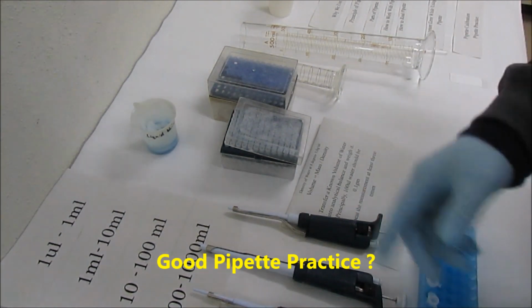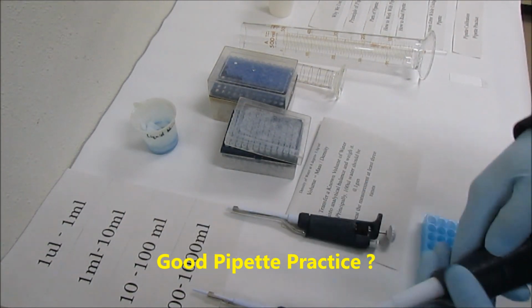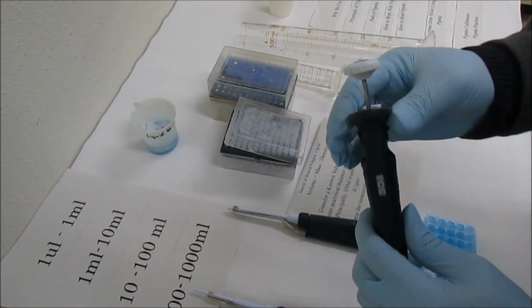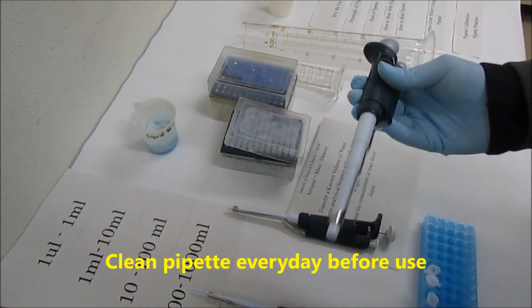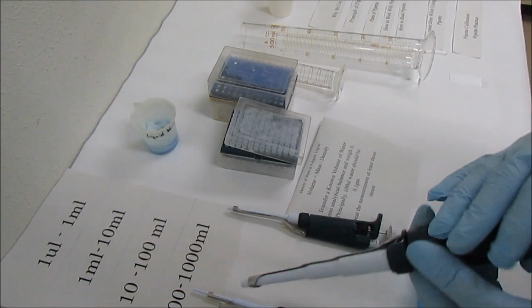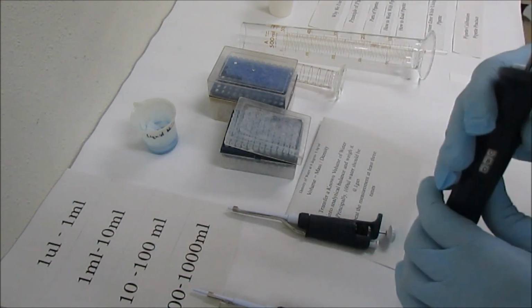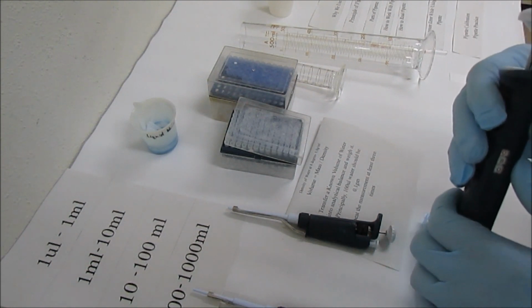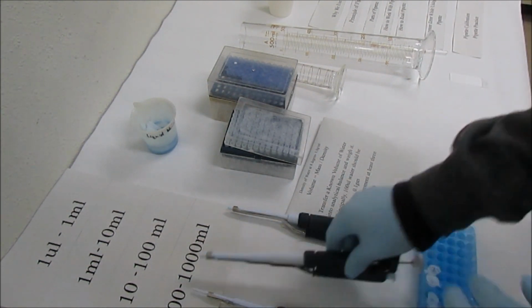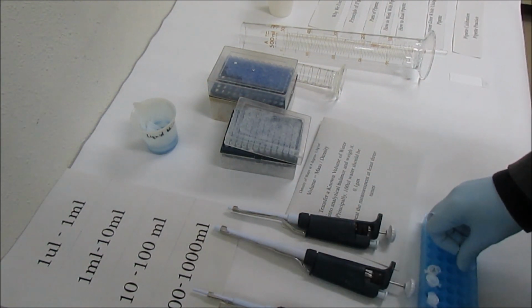So what are the good pipette practices? First, always clean the pipette every day before use. Sometimes a lot of dust goes inside, or sometimes the pipette is broken, so you always need to carefully examine it every day and clean it every day. Second, practice slowly.